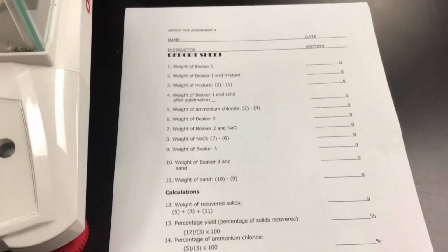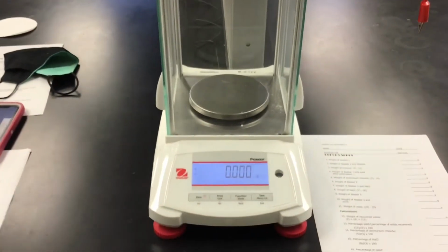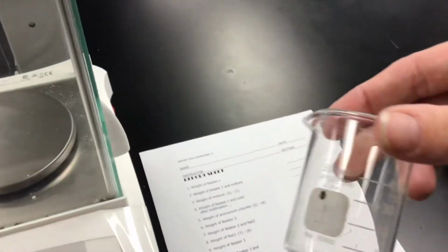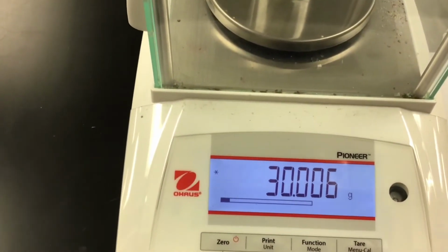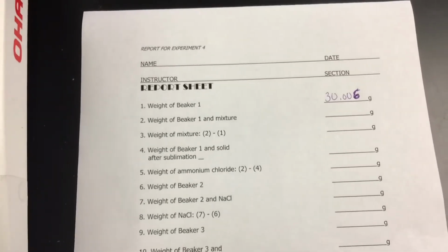The first part of the experiment, what we need to do is get the weight of the beaker. I'm standing in front of a balance here in the lab, and I'm just going to zero it out, even though it says it's 0, and I always make sure I tare it and everything is closed. I'm going to take this 50 ml beaker and put it on that balance, and then record that value. So the weight of beaker 1 is 30.006. That is what we're going to have right there.